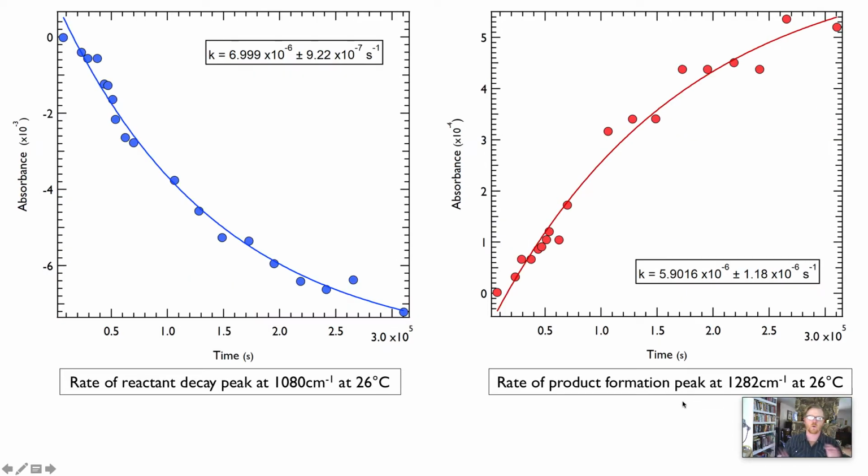And this is so cool. I was jumping up and down in the lab when they got these results, because it was the first time we did this experiment, and it worked beautifully. You can see wonderful first order decay. Isomerization is a first order process.